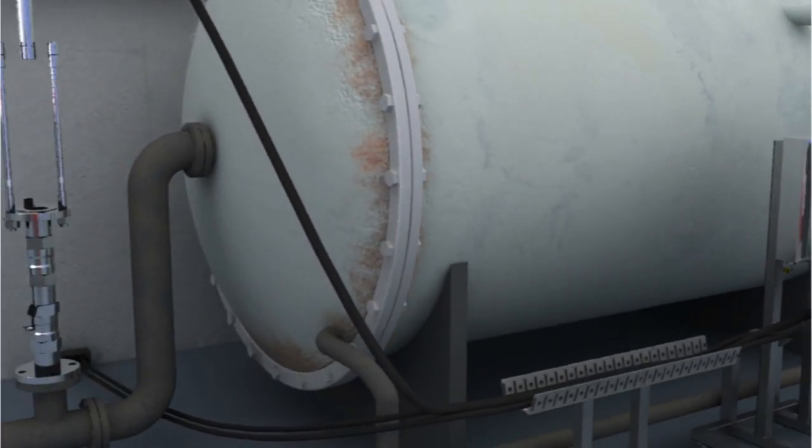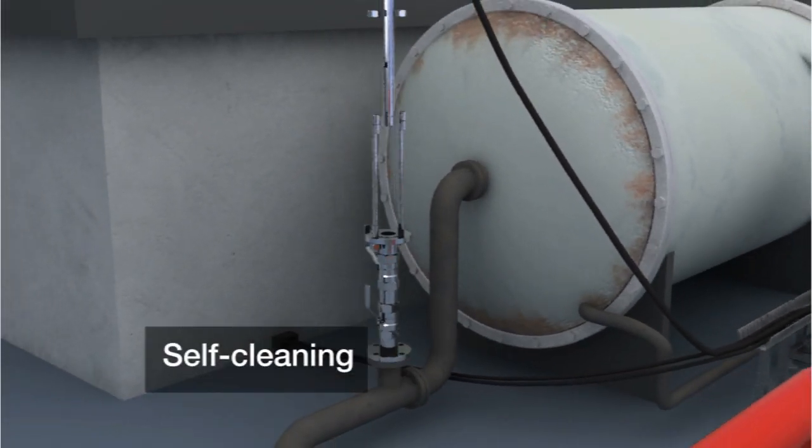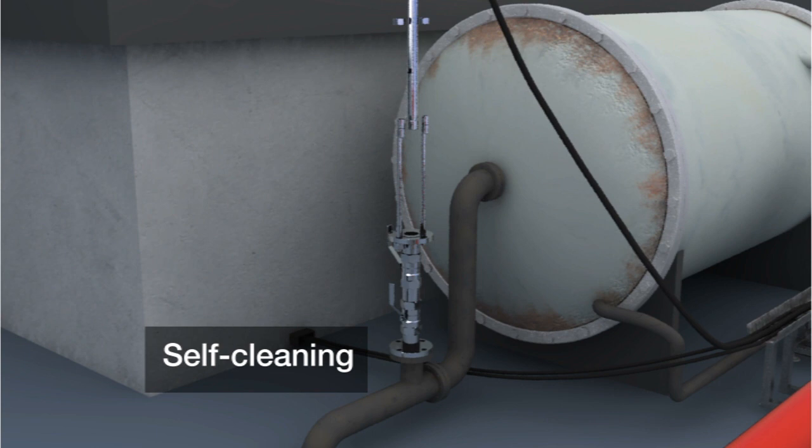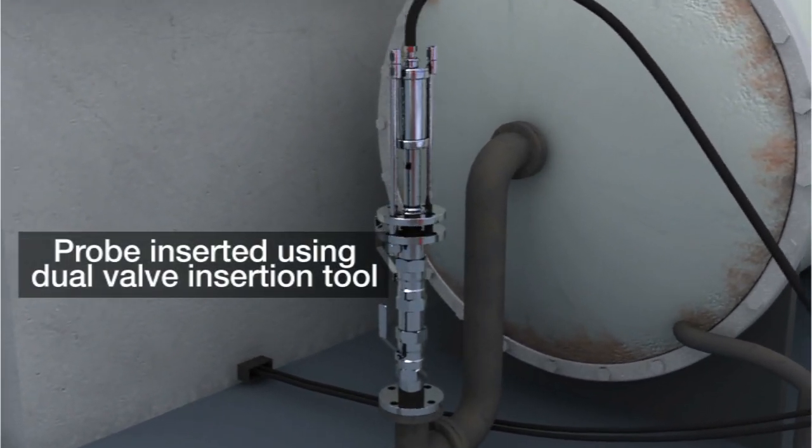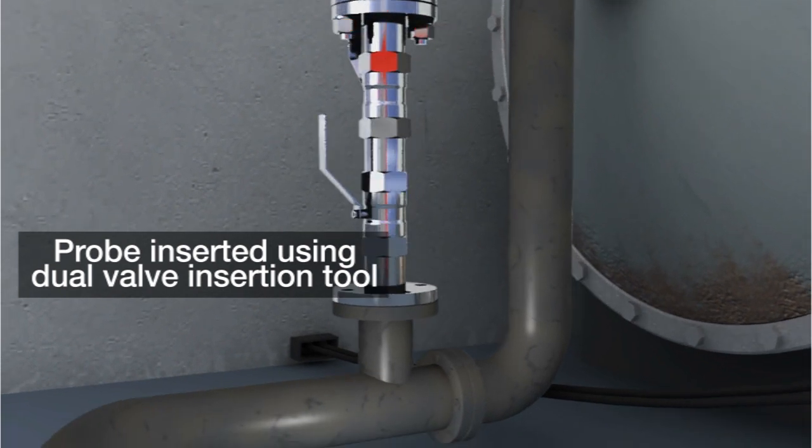Advanced sensors have developed an inline probe, with all the measurement capabilities and self-cleaning techniques as the sidestream unit. The inline probe inserts easily into a process pipe, utilizing a dual-valve insertion tool.